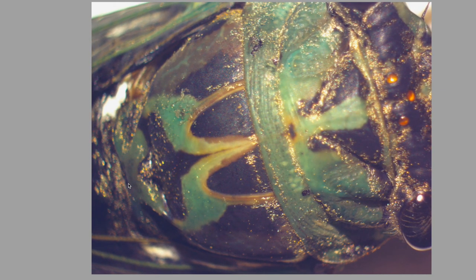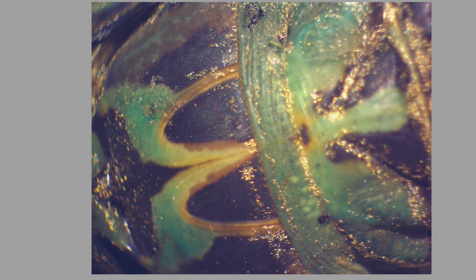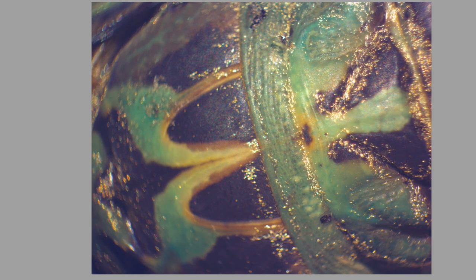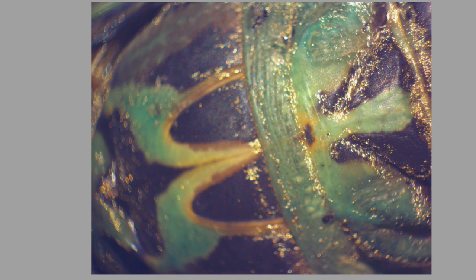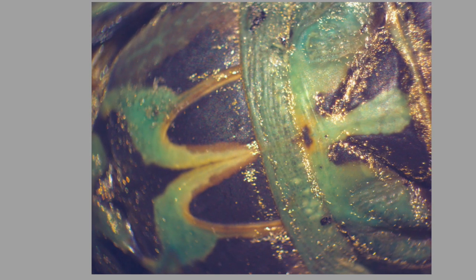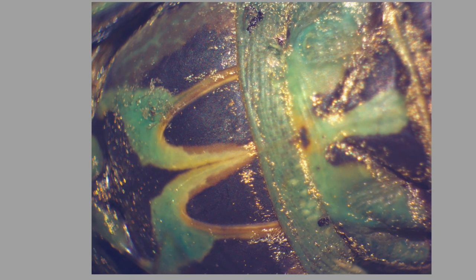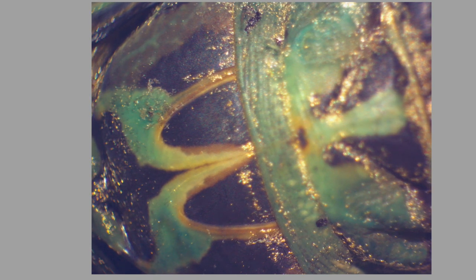Gosh, that's beautiful. It looks like gold, doesn't it? It's just hair. It's pretty. Okay, let's do 10X. Could be dusted up. Nope, that's like hair. I'm gonna take a couple pictures at different focuses, and then I'll just stitch them together later on. There. Really, I love the colors. Hey, look, it's the golden arches. Yeah, I'm horrible.